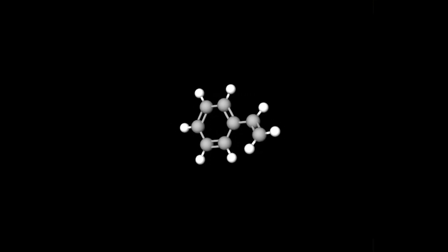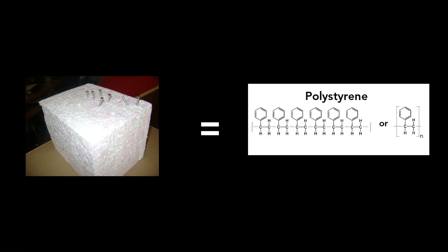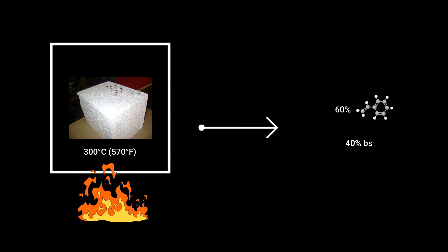I went on science/chemistry forums and followed someone's procedure. The first step is to acquire styrene, a flammable liquid that can polymerize into the well-known polystyrene, aka styrofoam. Basically polystyrene is a bunch of little styrenes linked together, so we just need to unlink them, but it's not easy because those bonds are pretty strong. The way we're going to do it is take polystyrene, pack it in a container, heat it to 300 degrees Celsius, and it should decompose into approximately 60% styrene and 40% byproducts.